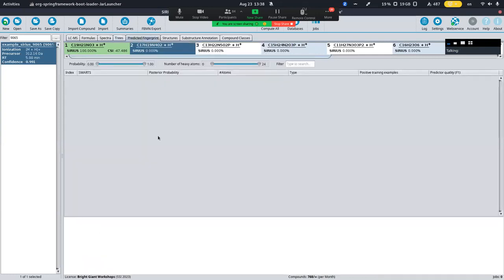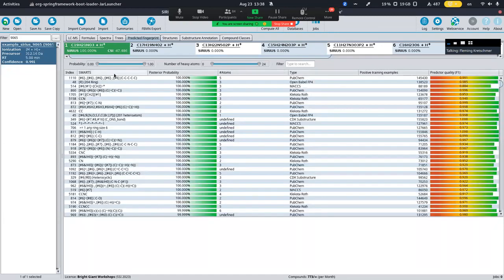Okay, now let's get to the predicted fingerprint tab. Here you can see, because in this top list I'm at the second molecular formula hit, I do not have a predicted fingerprint for this molecular formula, but if I go to the first hit, I do have a fingerprint. And just remember, because Marcus also talked about it, right now we are still in the de novo workflow pretty much. So even if you don't have any structure database hits later on, you will see a predicted fingerprint here. So you will see what CSI:FingerID thinks that your compound looks like structure-wise.